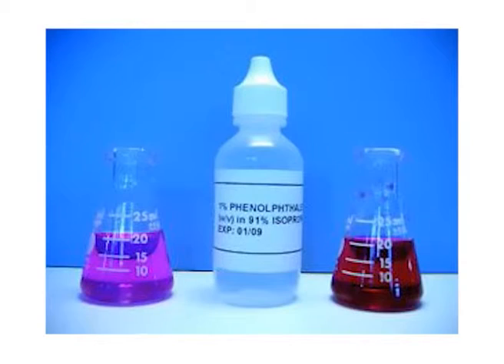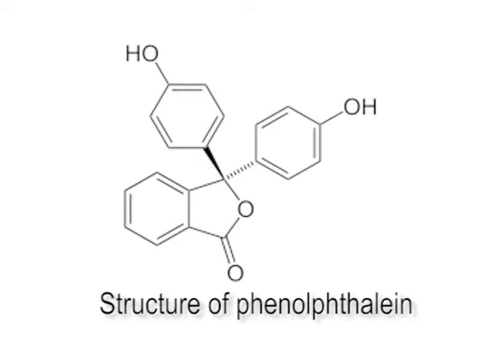The second chemical reagent that reacts with the heme component of blood is phenolphthalein. A mixture of phenolphthalein around 2 grams, whose structure has been shown on your screen, is taken.